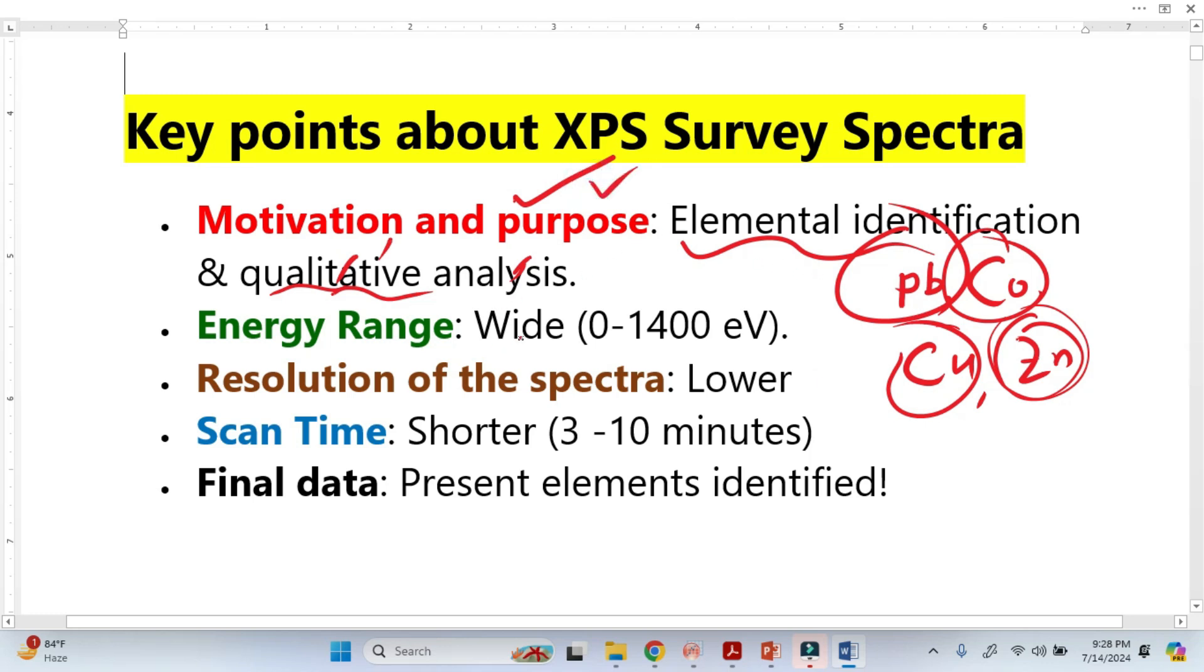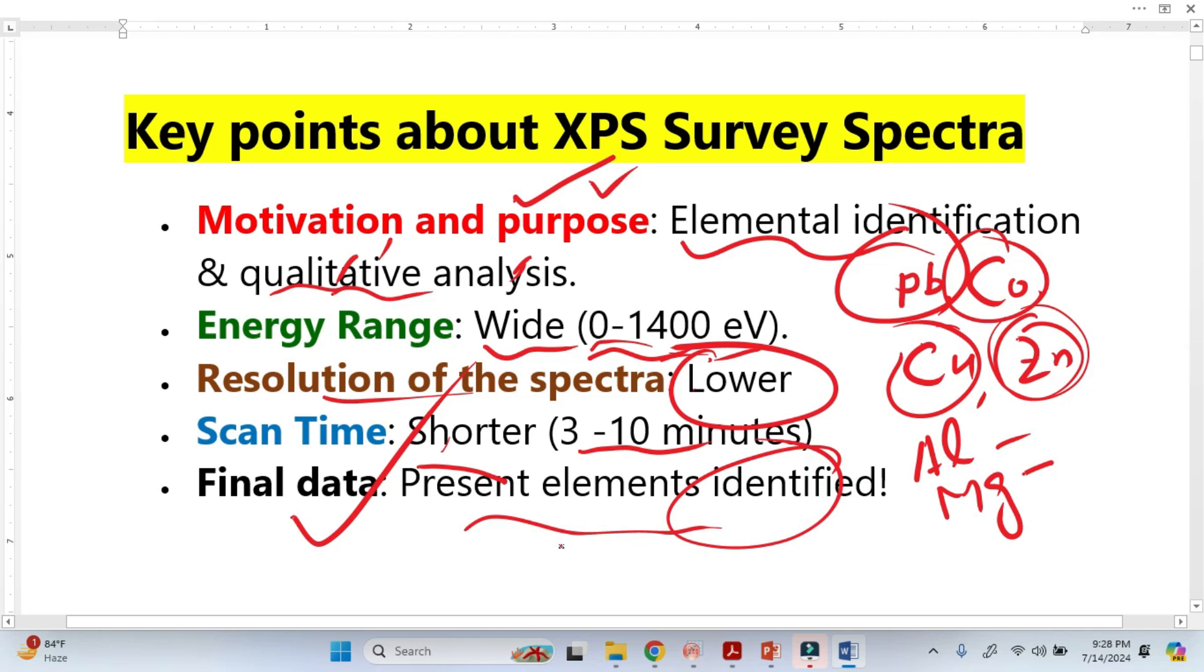The energy range is wide here because we use two sources, one is aluminum, another is magnesium. The resolution is lower here. The scan time is also shorter. You will see that for high resolution we use longer time, but for this it's very short time. And we get the final data, we get just the identified elements in the sample.